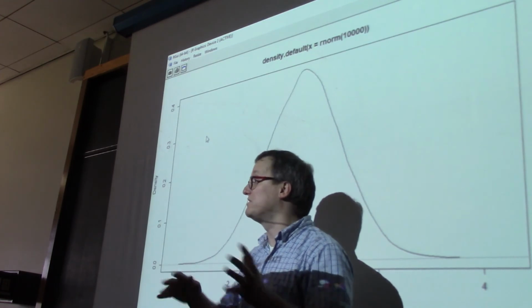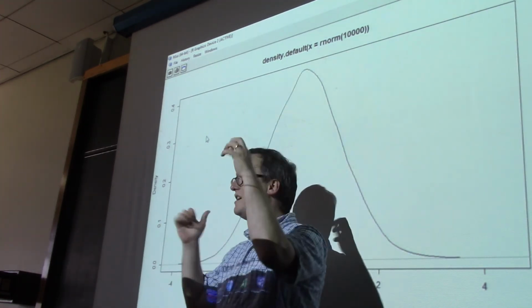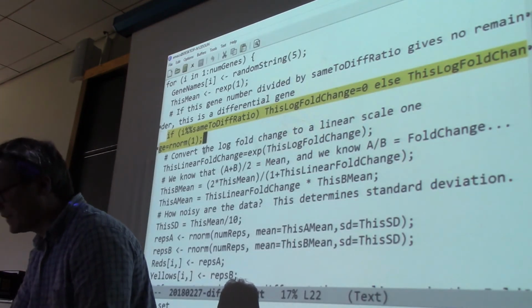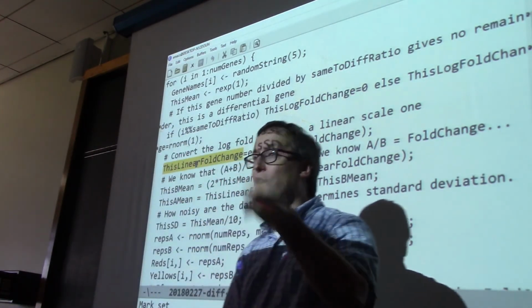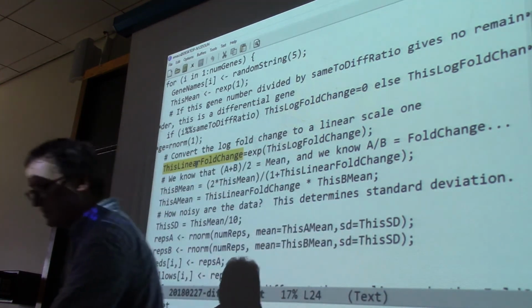The short version for this is in the volcano plot. I wanted to make sure I had some values that were significant, but not major shifts in either direction. Okay, we have to change that back to a linear fold change because that's a log value, and I had to use the exp function for this.